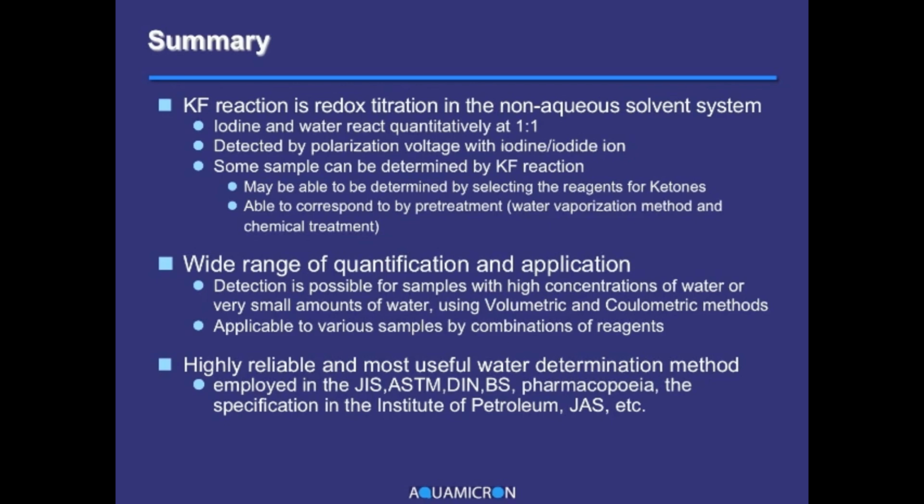Substances exist for which the water cannot be measured. Some types of substances can be measured by selecting suitable reagents, for ketones, for example, or by adding salicylic acid. Some thermally unstable substances can be measured with the optional water vaporizer.